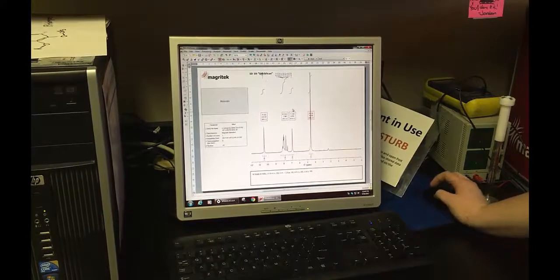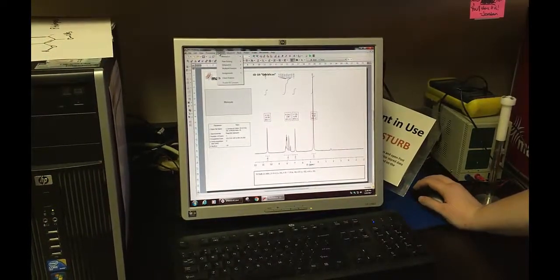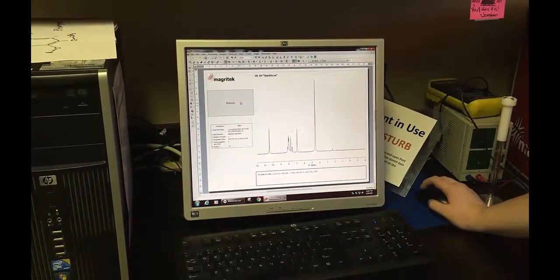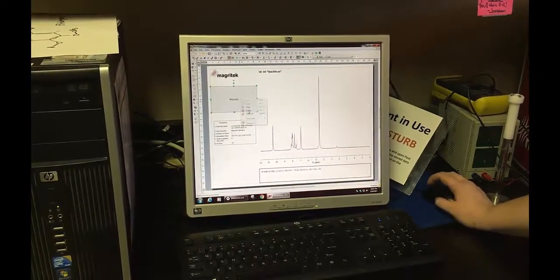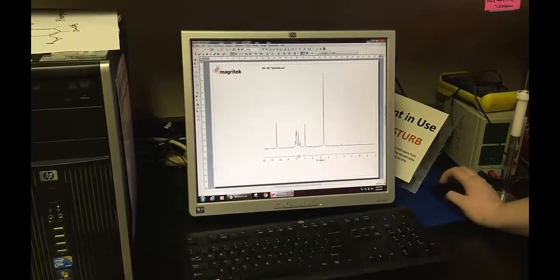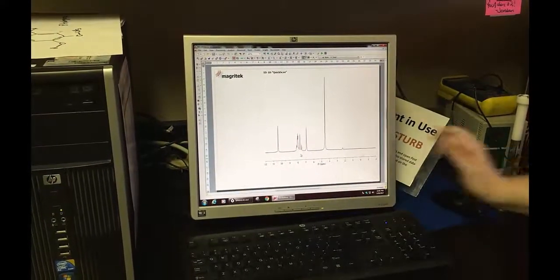So I'm going to get rid of all this junk right here. Go to Analysis, Peak Picking, and go down to Delete All. And then come over here, delete this one, and this one down here, because you don't need any of that. So now you have a clean spectrum.